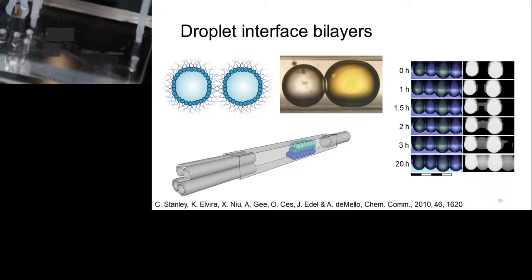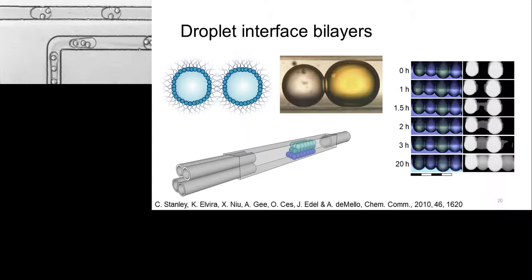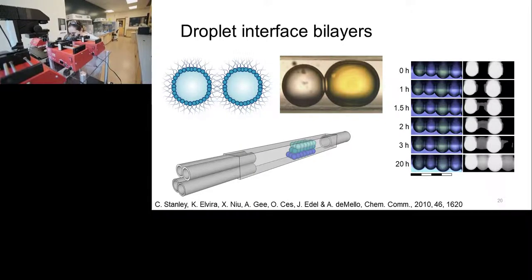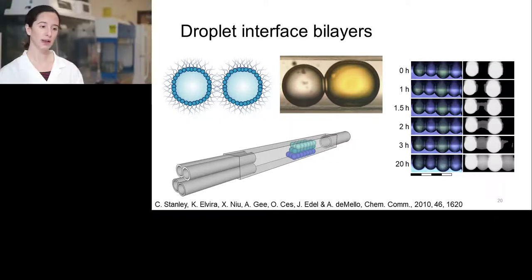What we do is we build artificial cells on a chip. So we are very interested in the cell membrane. The cell membrane is kind of the skin of the cell. It covers the cell and it allows the cell to communicate with the outside world. And we build these artificial cells by building the cell membrane on these chips and using that to look at how drugs get into cells.